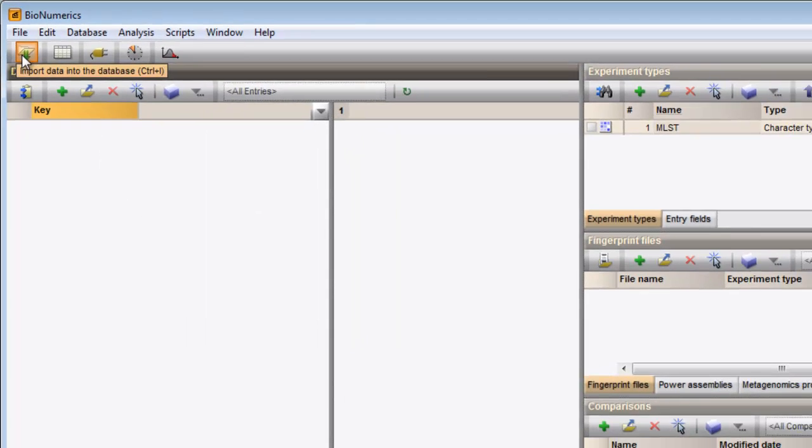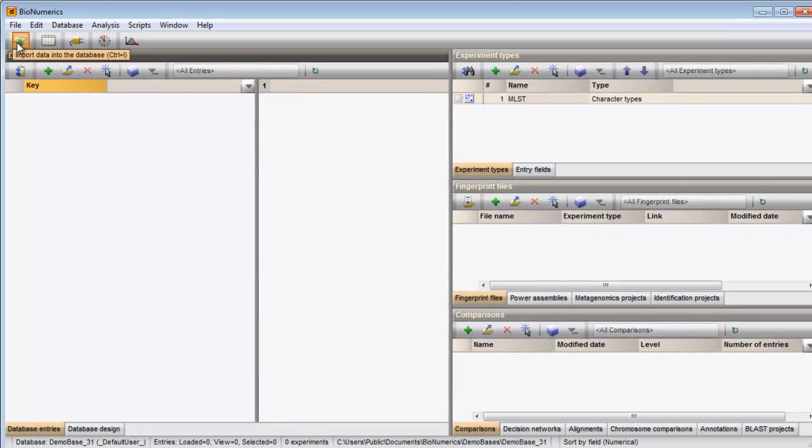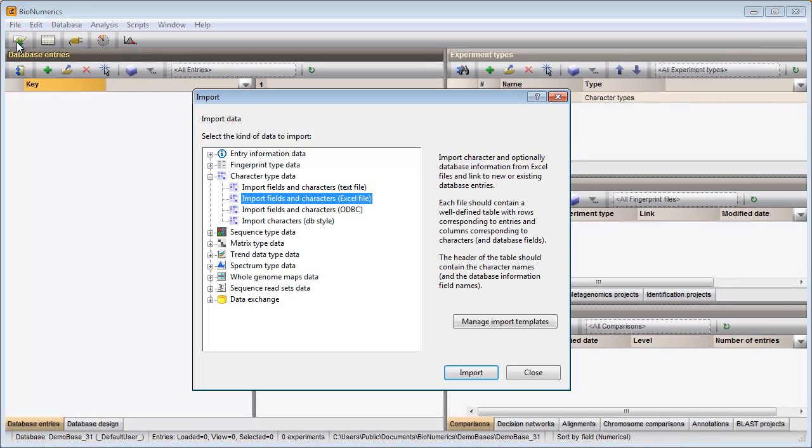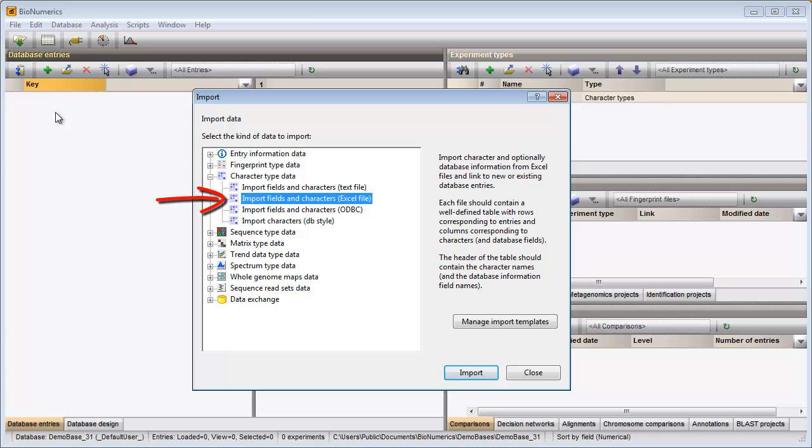When I press the Import button in the main window, the second option under the topic character type data allows me to import database and character information from an Excel file into my database.